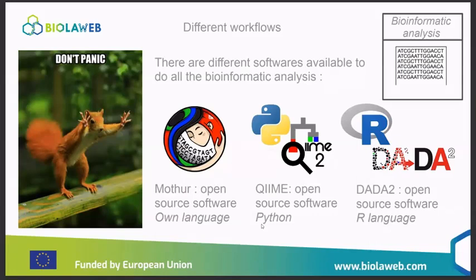It's not an easy part for everyone, but you have different software available to do all this bioinformatic analysis.